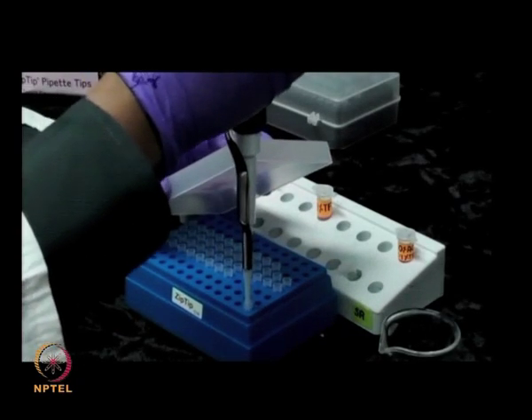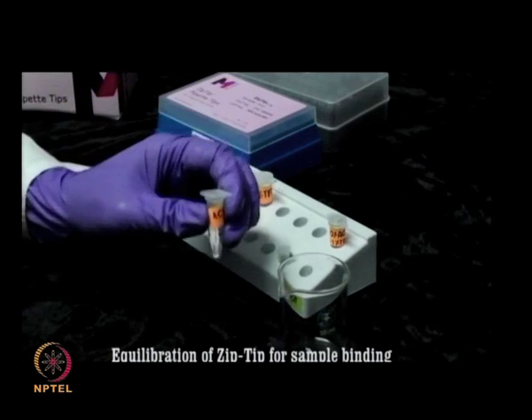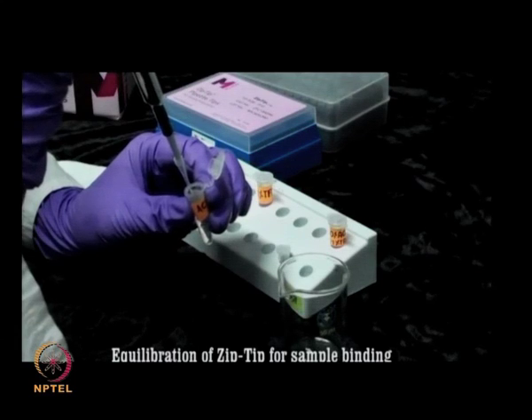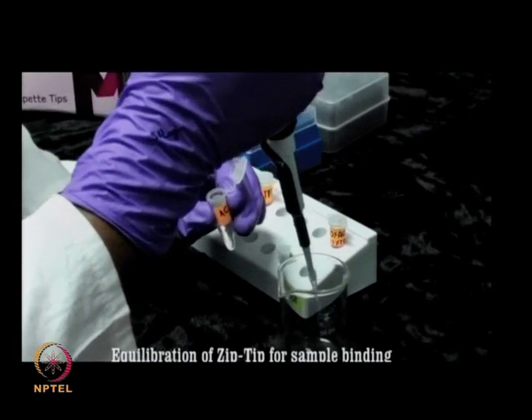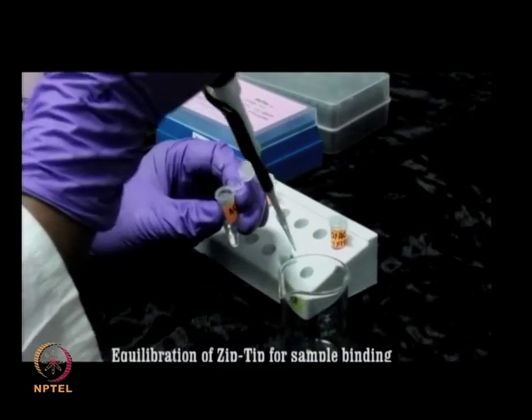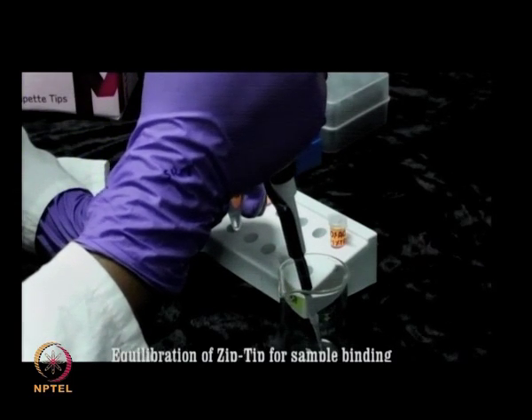The in-gel digested protein samples are further processed by using ZipTip pipette tips, which contain C18 or C4 media for enrichment of peptides prior to MS analysis. A ZipTip pipette tip is a 10 microliter pipette tip with a bed of chromatography media fixed at its end. It is used for concentrating and purifying peptides as well as removing salts, detergents and interfering agents.